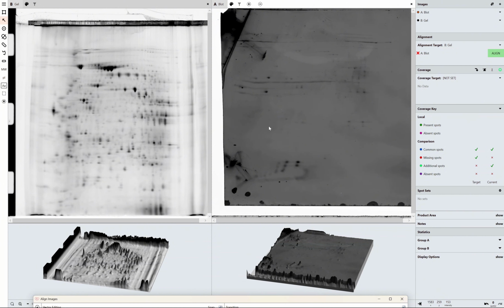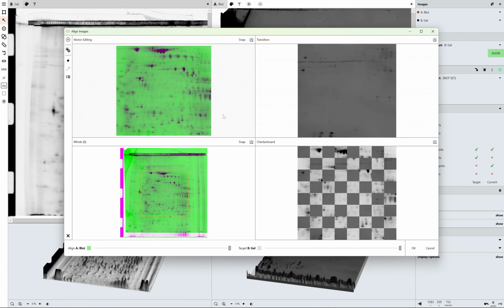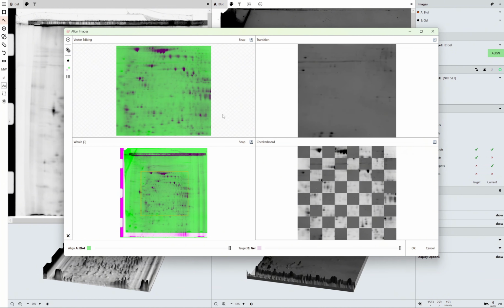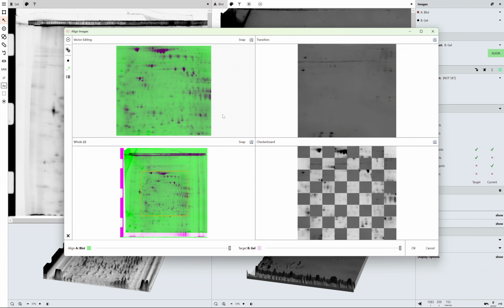And in situations where there are few spots, there are much fewer sections for the images to align onto each other. There are very few anchors. If most of your image looks like this grey, what are we going to latch onto to ensure accurate alignment? But the idea behind the automatic alignment, and if you've got greater coverage images it will work better than this, is that you remove the human component of manual alignment.